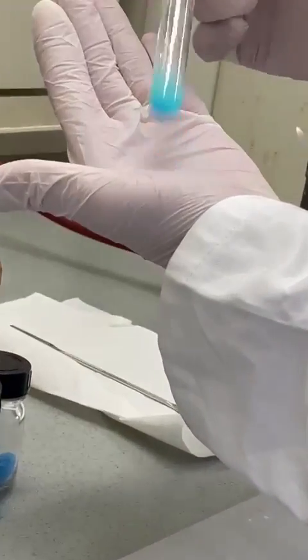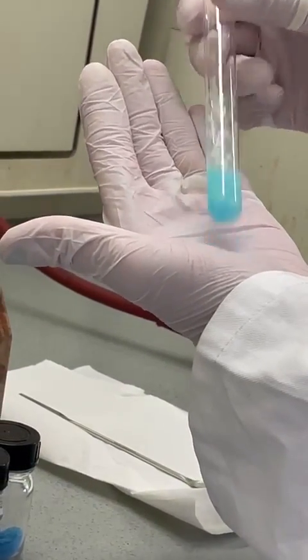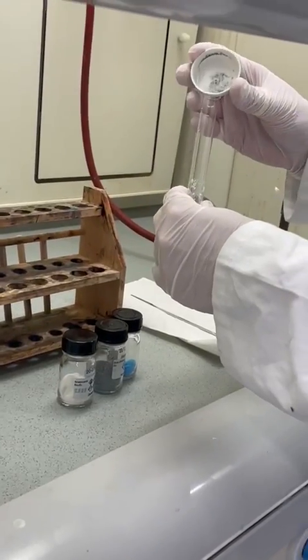Now, back to chemistry. To detect arsenic, we must bring it into its trihydride. Therefore, we add zinc granules to the mixture, which produce hydrogen with the sulfuric acid. In many older books, it is stated that this hydrogen is nascent, but newer findings have disproven this theory firmly.